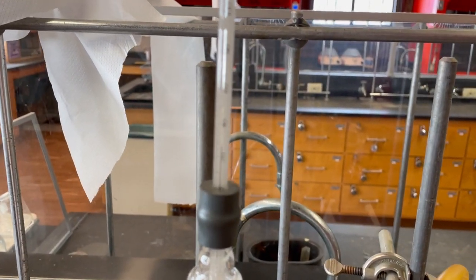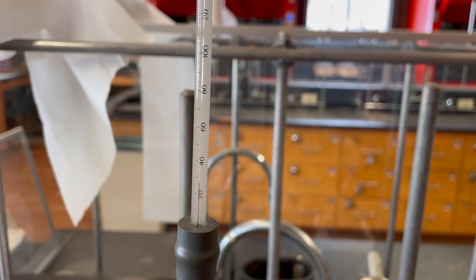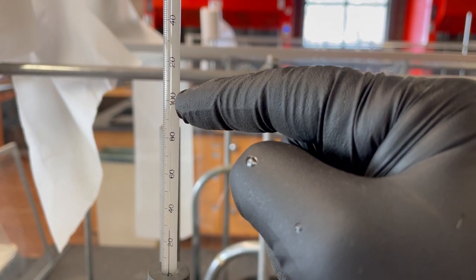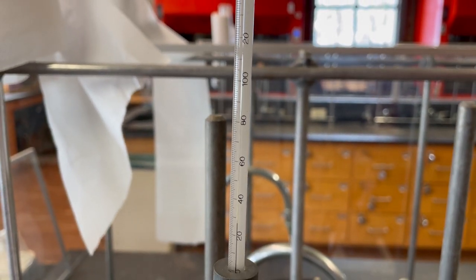Okay. Now, you also want to make sure that you note on that collection flask which fraction it is, the temperature, right? And then you might see it eventually start to shoot up, up, up, and then maybe stop at 100. What's 100? Oh, that's weird. It's water. So once we start increasing the temperature of that distillate, then we know we have to stop. Okay.